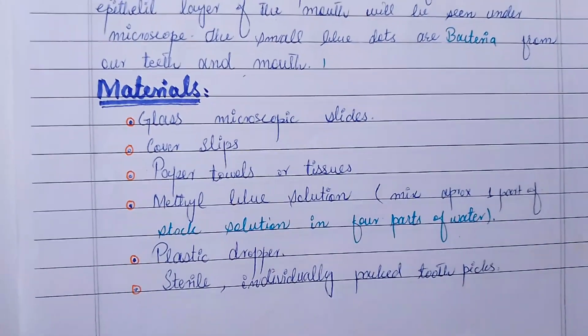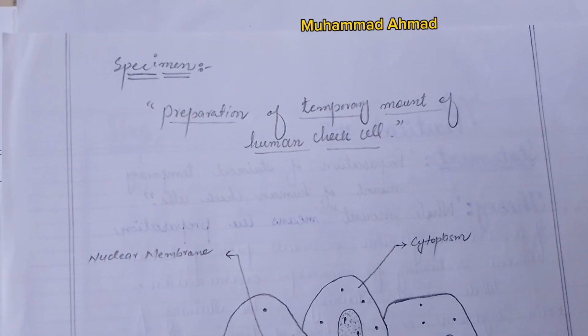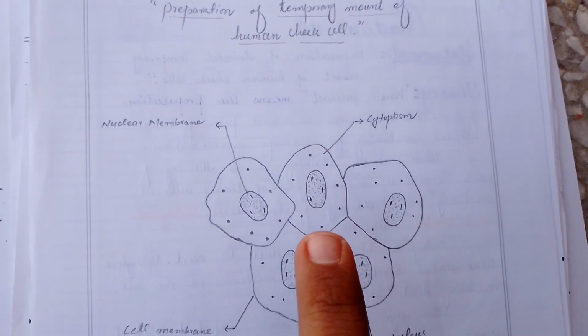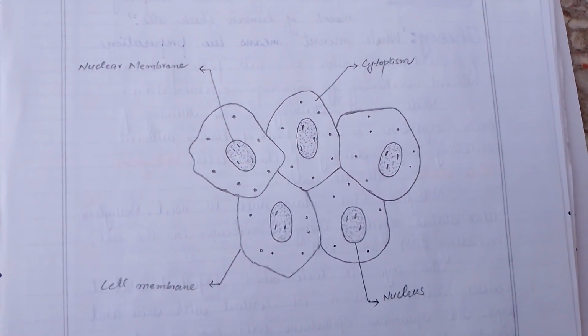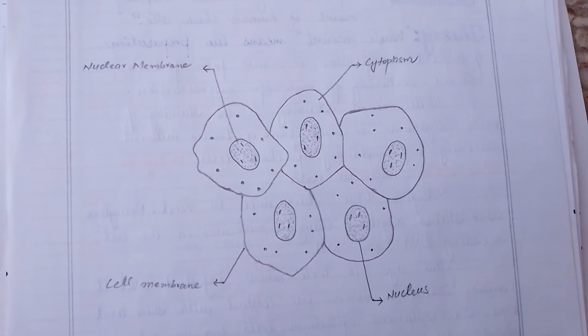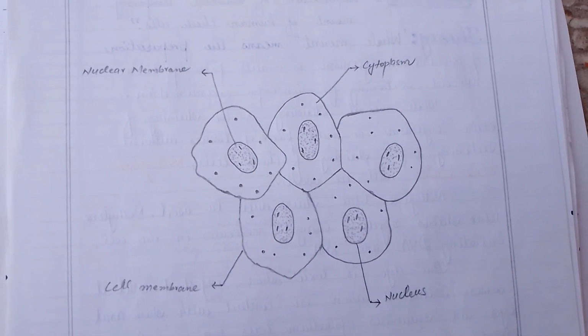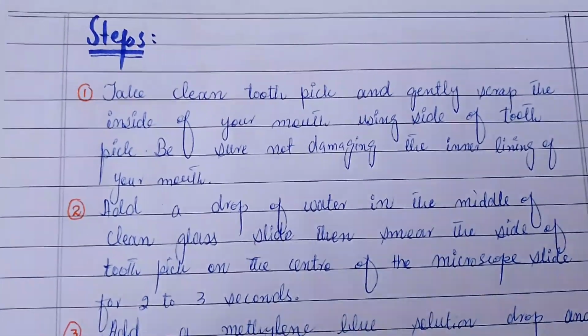Now come towards our next page. Here is the specimen and preparation of temporary mount of human cheek cells slide. You can clearly see the cytoplasm, nuclear membrane, cell membrane and nucleus of the cell, which are shown in this diagram. You can draw this on the clear page of your practical. Now come towards our next page.